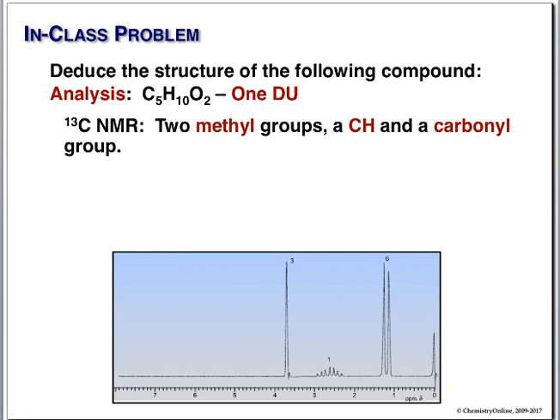What does that tell you? I am an isopropyl group. So you write down an isopropyl. We have a CH3, that's an isolated methyl. So you write down a CH3 all by itself.